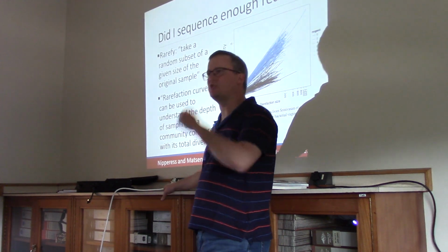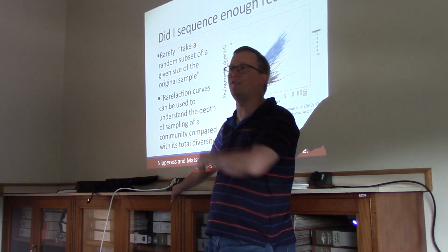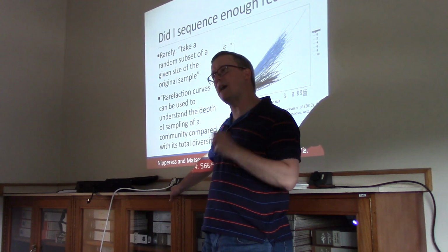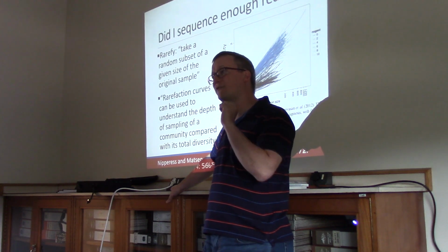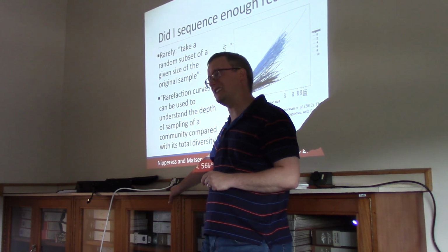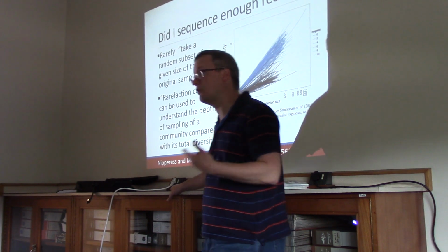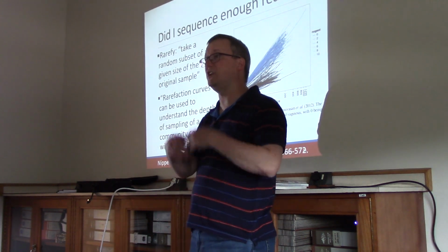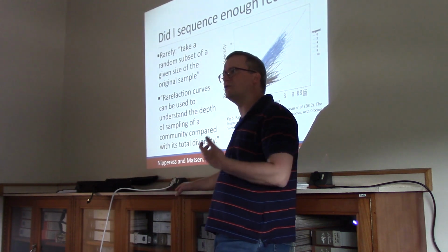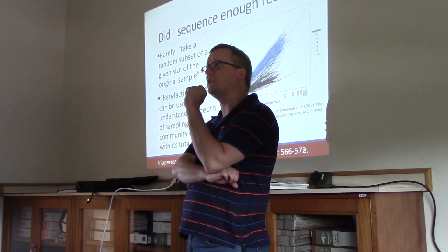So we have next generation sequencers, massively parallel sequencers that are producing volumes and volumes of sequencing data from individual samples. Does that mean that we have sequences from every species in a sample? It does not, because there's a lot of dynamic range associated with microbial communities, some that are present in really huge numbers and some that are present in really small numbers.